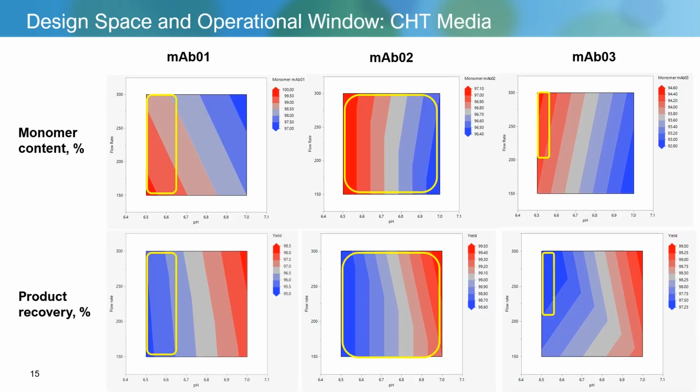These are response surface plots generated by the DOE software. I would like to point out that for all 3 maps the responses showed very similar patterns. It's worth noting that the numbers on the scales are different. These results correspond to the entire peak eluted in the salt gradient, without any collection criteria adjustment. What would happen in the next optimization round?